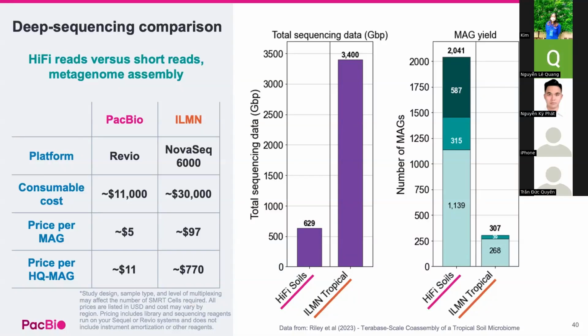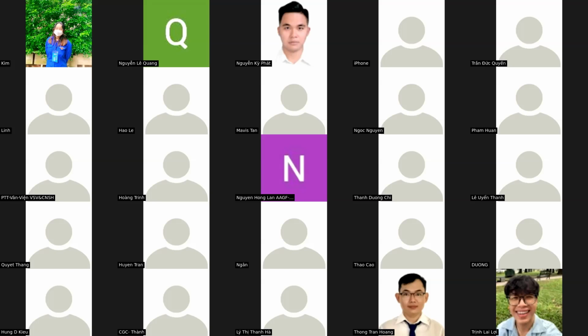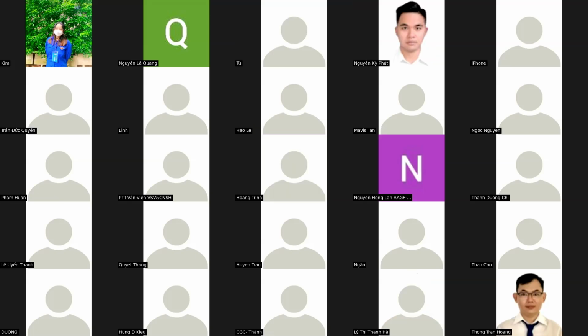Right. So now we move on to the next part about the bioinformatics analysis for PacBio long read sequencing. Ting Ting, please check it.